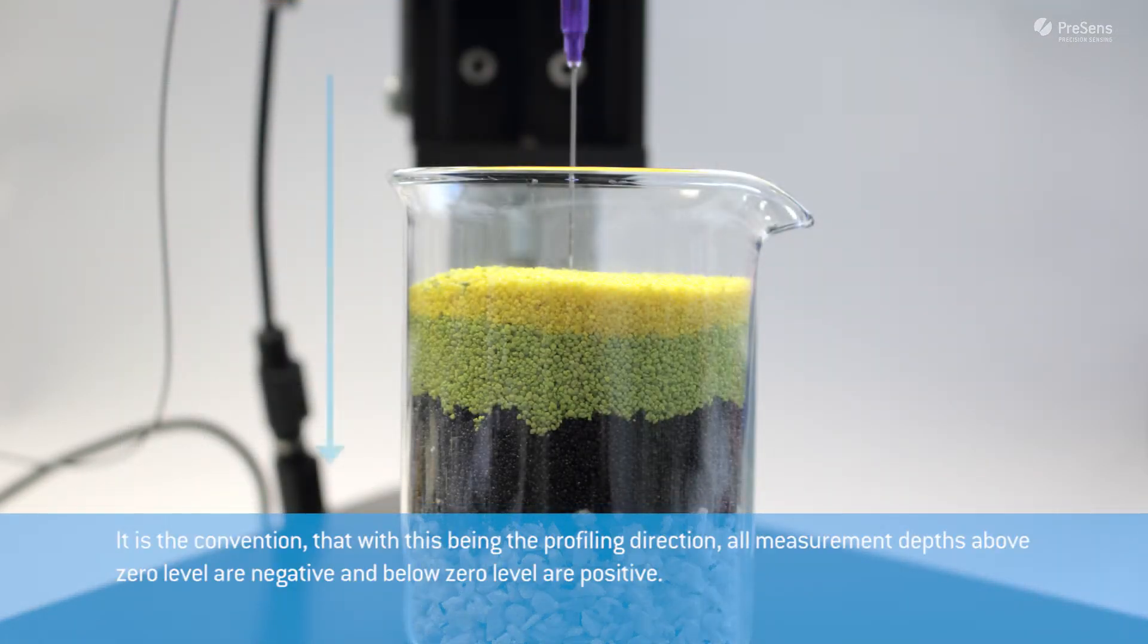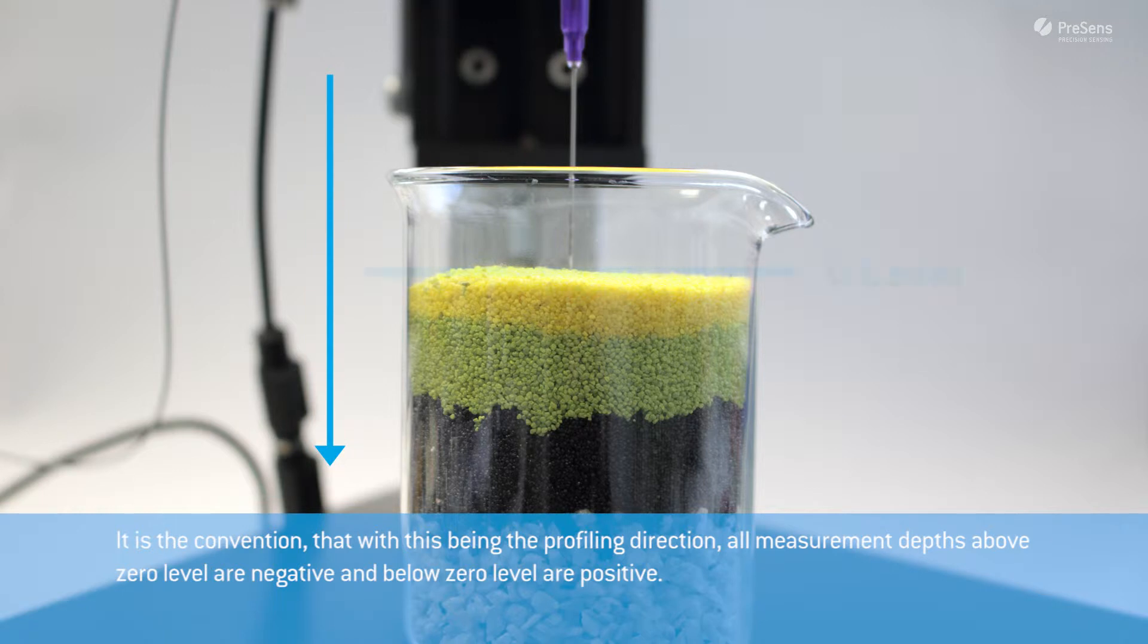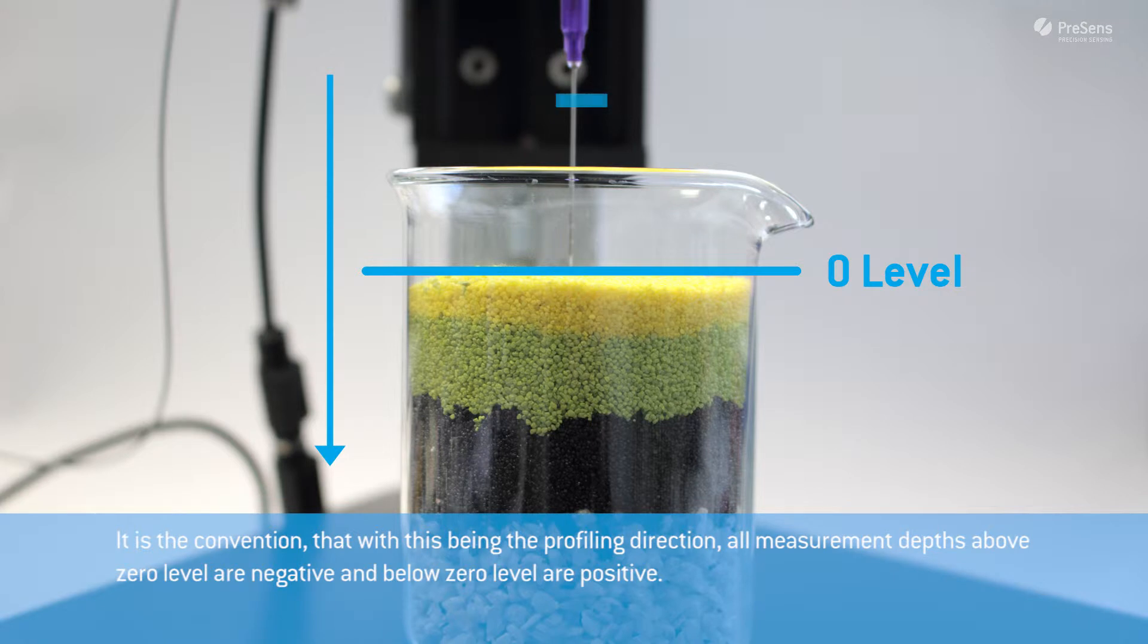It is convention that with this being the profiling direction, all measurement depths above zero level are negative and below zero level are positive.